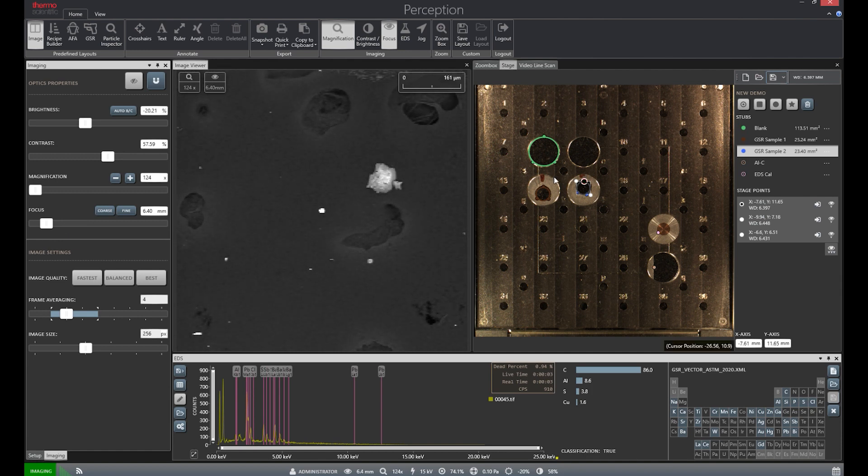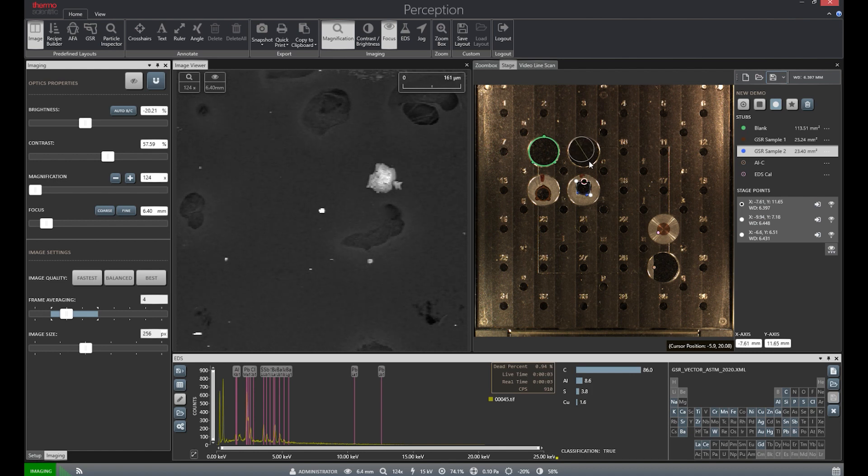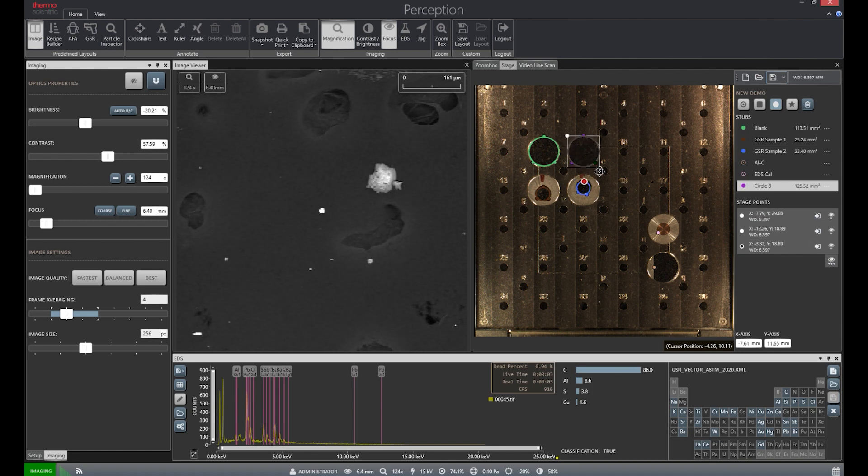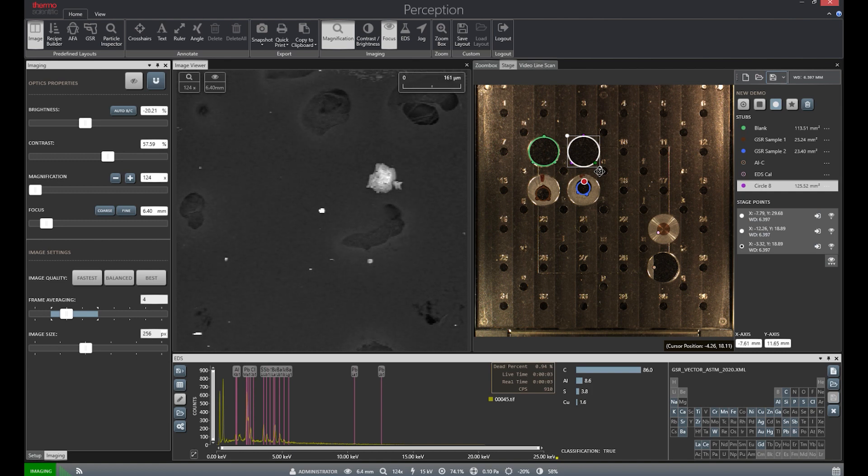Stage files are created using the far right-hand menu. Sample areas are created by simply selecting your area type and then left-clicking and dragging over the sample stub. Multiple different areas can be included in a singular stage file. The great thing about these files is that they do not require the operator to create them from scratch as they can be saved and reused later.